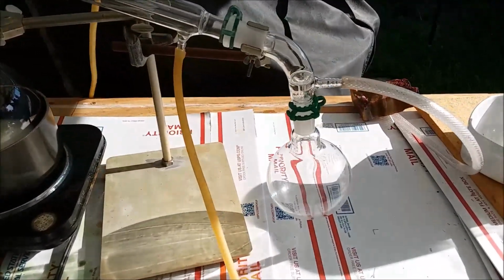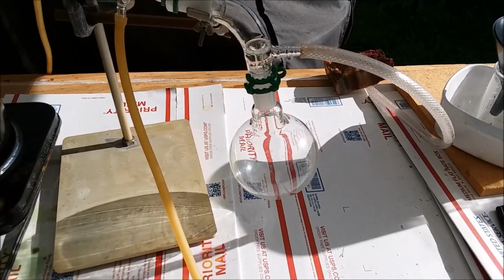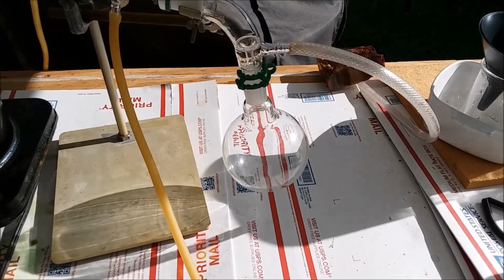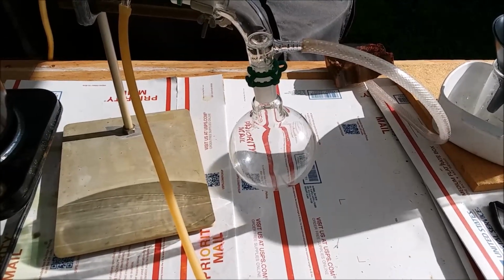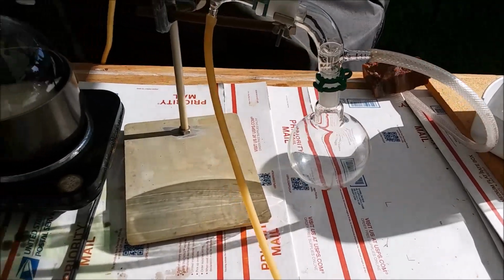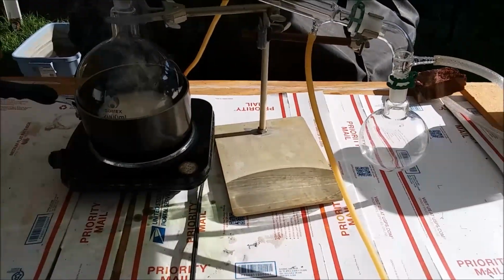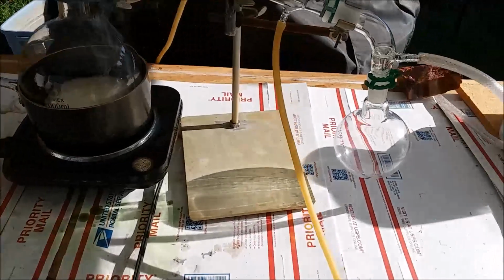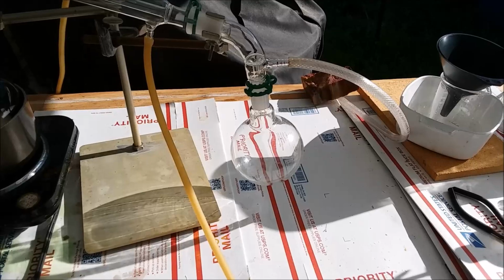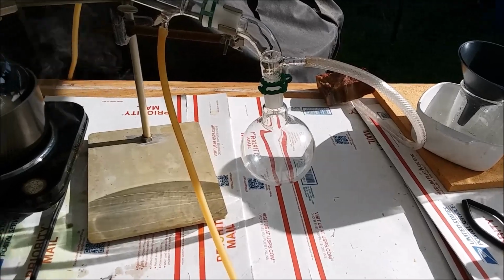Another thing I'm doing a little different is I have a piece of sacrificial tubing over here that's going to take the nitrogen dioxide gas that's produced in this process and vent it far away from me, so I don't have to have it in my face while I'm working over here on other projects on my large workbench while this is going on. I can babysit this reaction and throttle the temperature as needed. Oh boy, I must have dribbled a lot of oil on the heating element. Well, it'll burn off soon enough. Anyway, this is just a sacrificial piece of tubing. It probably won't last long with exposure to nitrogen dioxide gas, but at least it'll get the fumes out of my face while I'm working on other things.